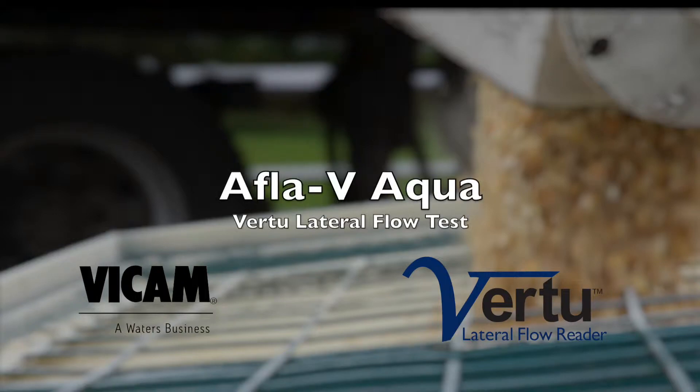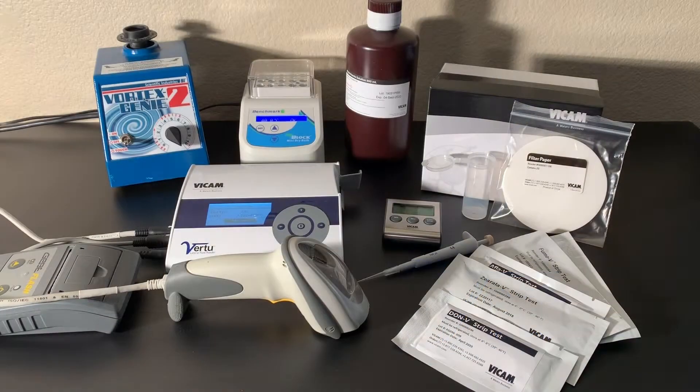The AFLA-V Vertu test is part of the Myco 5-in-1 single extraction series of lateral flow test with precise numeric results.